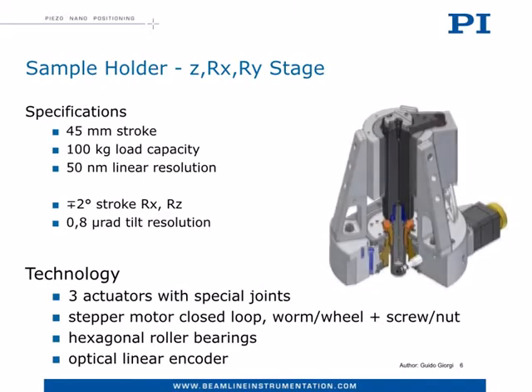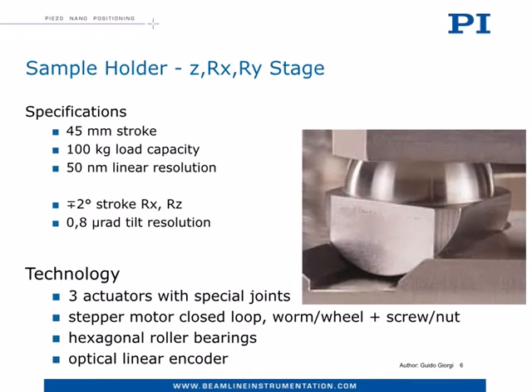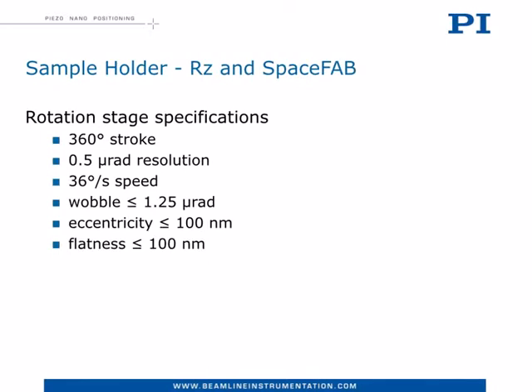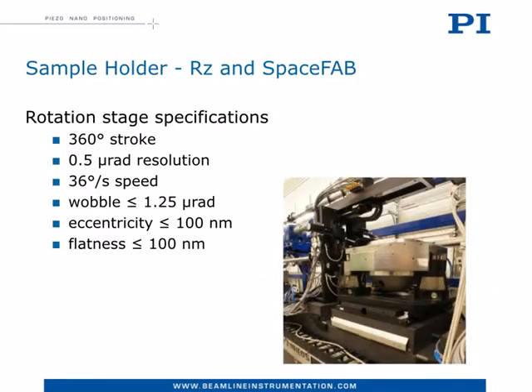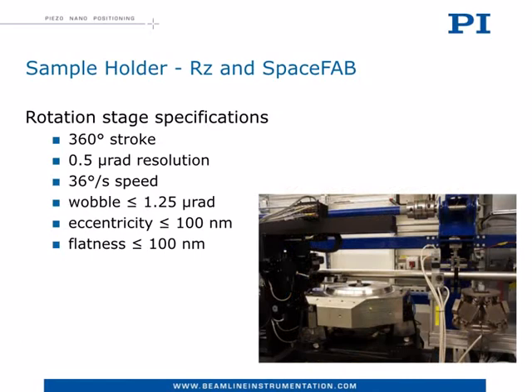An important detail of this solution are the spatial joints selected to meet stiffness and positioning freedom. Finally we have the tomography stage, which is basically a very accurate rotation stage with some specifications pushed to the limit. Let me stress especially the wobble, the eccentricity, and the flatness values. This extreme accuracy is required by the tomography application and is needed to have a pure rotation of the sample without side shifts, allowing easy image reconstruction of the several shots done all around the sample.